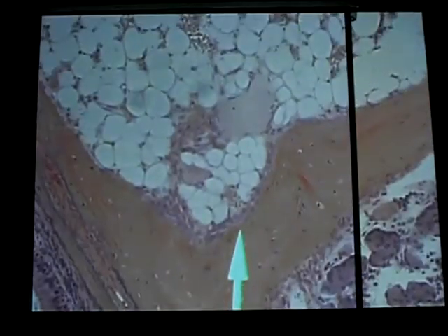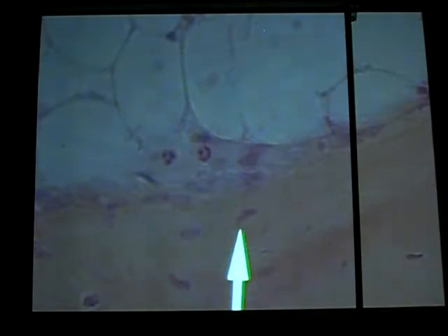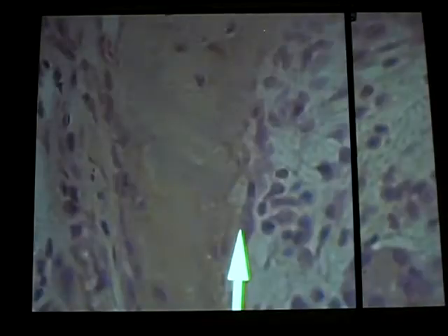Like over here, what is this? So I classify the tissue over here. What's that? Bone. Sorry, I was trying to get it. Smoky bone? Or spongy? Oh, spongy. Yeah, so that would be spongy bone, because we're not seeing any Haversian canals here. No, I thought you said smoky. I need to sit down. I don't know what that is. Alright, so that's our respiratory mucosa.